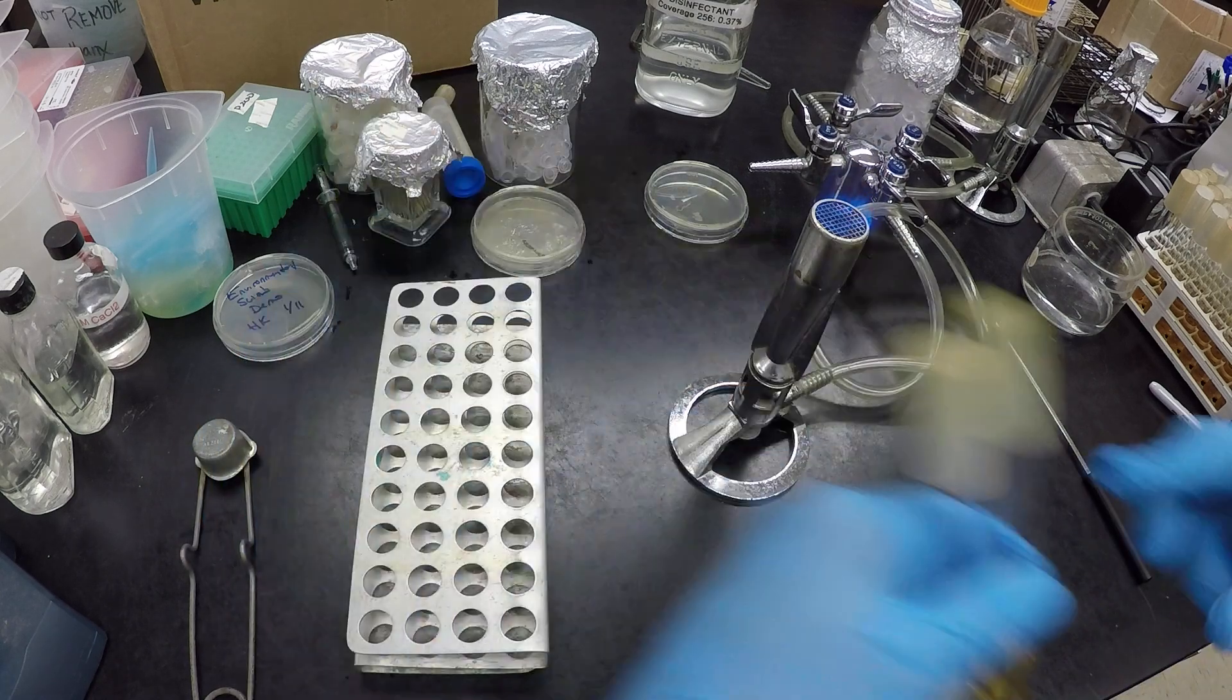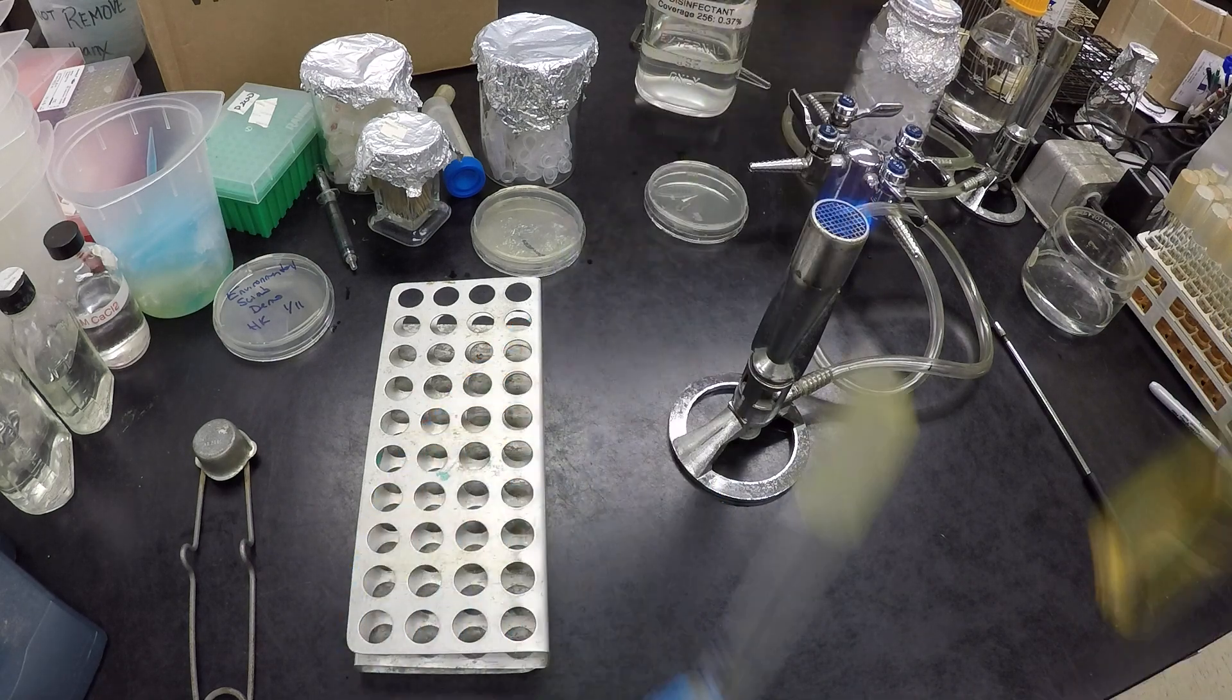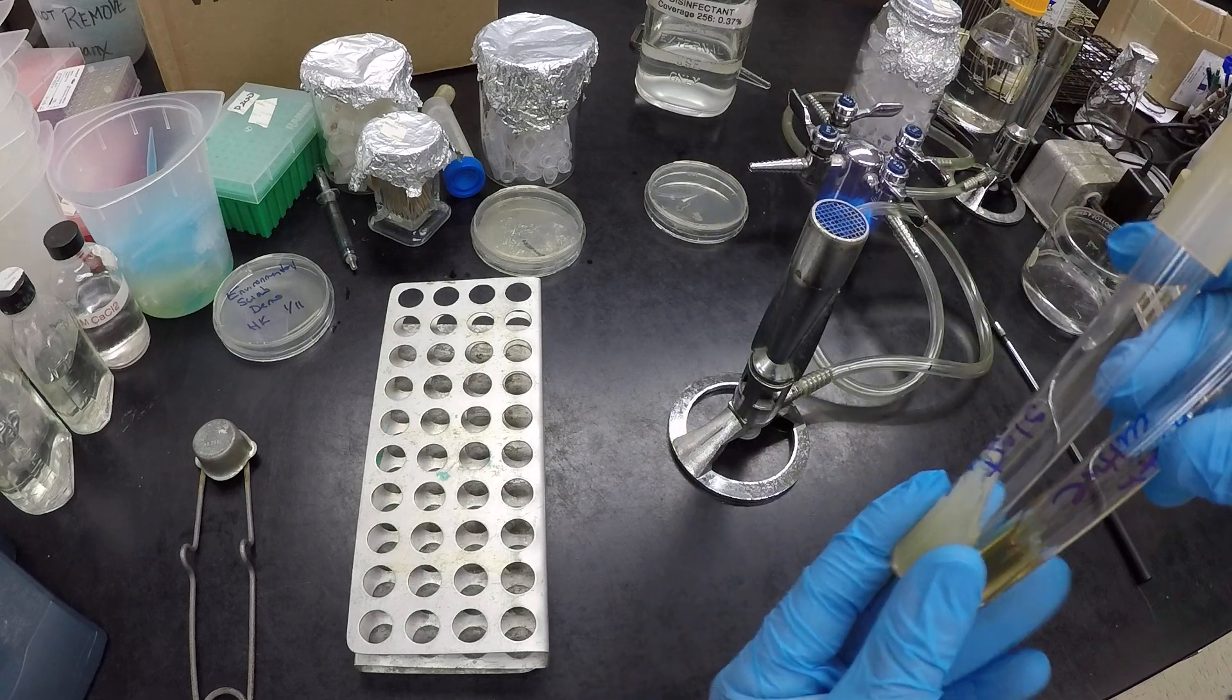And our tubes for the most part are going to come in two forms: our slant, which is agar in a tube slanted, and our broth, which is liquid medium. So we should know these already.